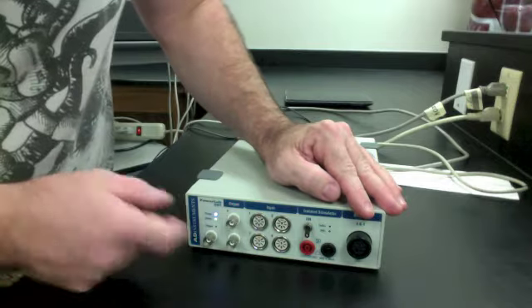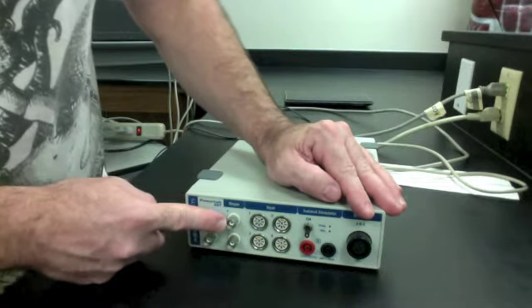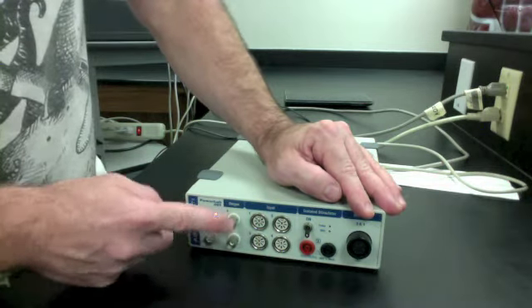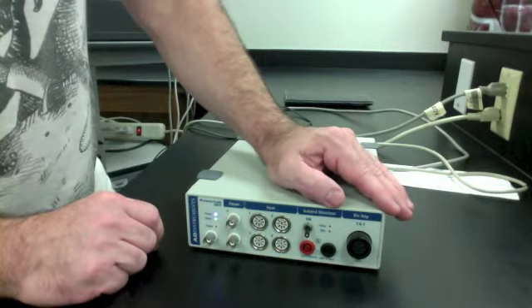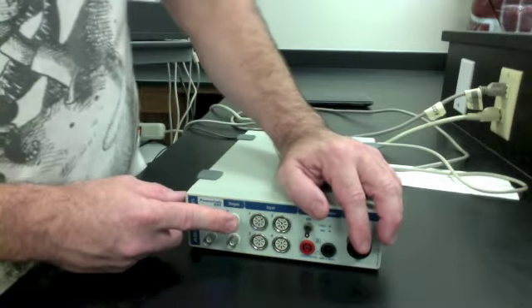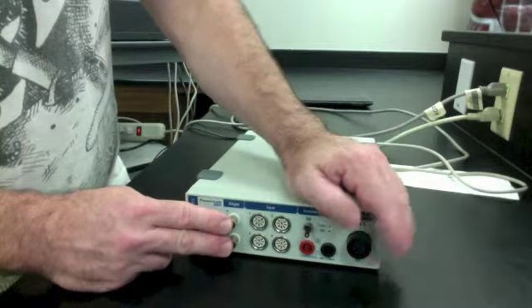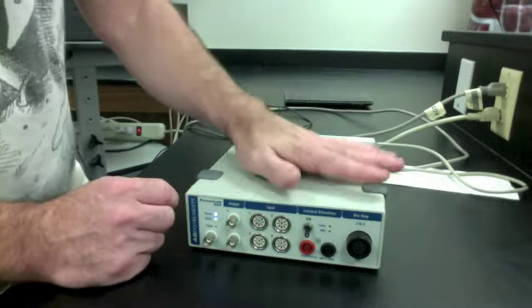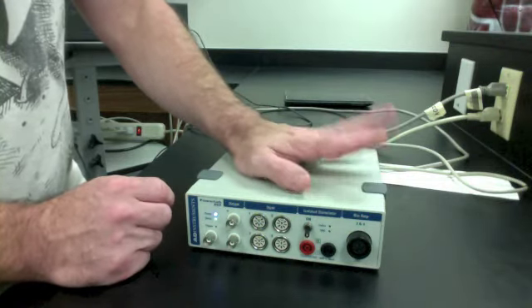We also have the ability to deliver light shocks, right? So you see we have an output here, and so we could deliver electrical shock, or we could have something where we signal that we need to start recording. So another thing this thing can do is I can say if I press a button and send a signal in, then I want to start recording, right? Or if a particular event happens, then I want to start recording. So it has quite a bit of flexibility, and this is actually quite a powerful instrument if you really know how to use it. We're going to be using it in a fairly simple way.